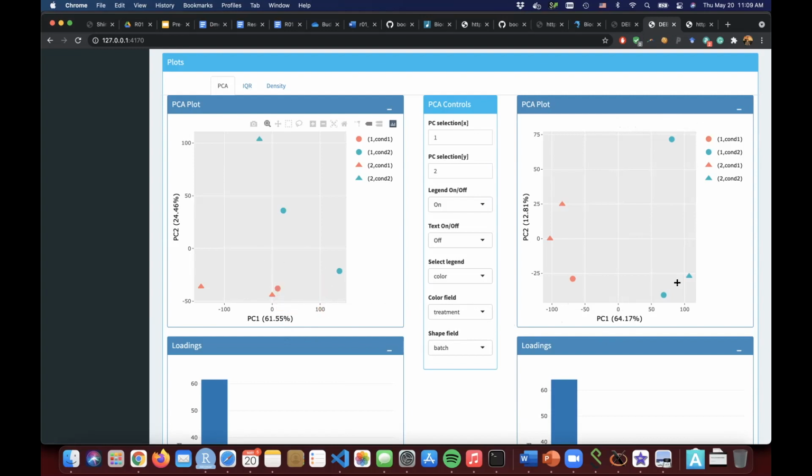That's why you don't see it, but you can actually decide which one is better, applying the batch effect correction or not applying it, because sometimes when you apply it, you might lose the real difference between the conditions. So it might affect your findings. So you should be sure that you have the batch effect by looking here, like Elisa showed. For example, she was working on time points, and per donor, the different time points actually got together in clustering, and it shouldn't be like that.